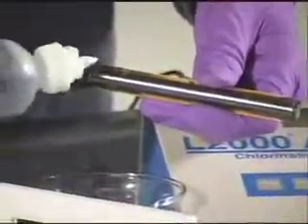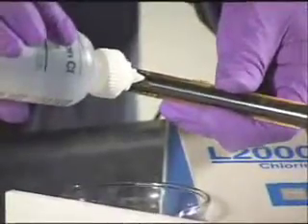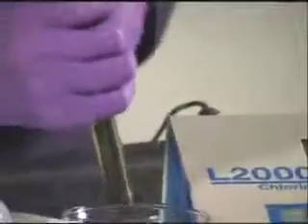On the side of the electrode, near the top, is a port that is used to fill the electrode with electrode filling solution. This and distilled water are the only solutions that should ever go into the electrode.